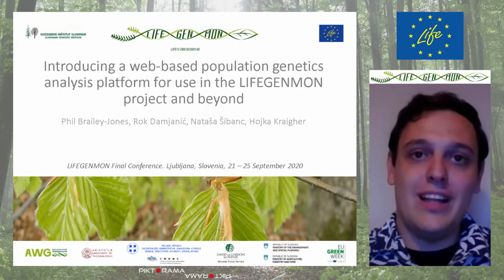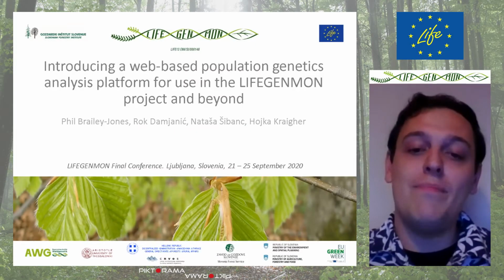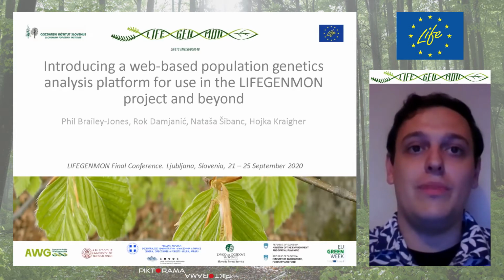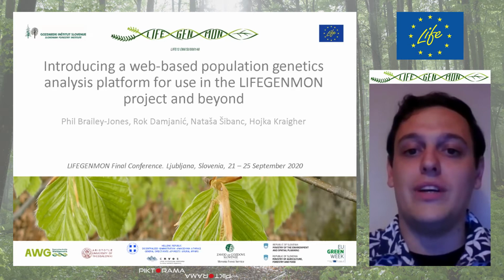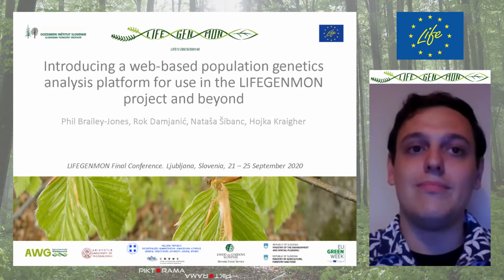Hello, I'm Phil, and I'm going to introduce to you a web-based Shiny application which can be used for population genetics analyses required in forest genetic monitoring within the LIFEGENMON project.